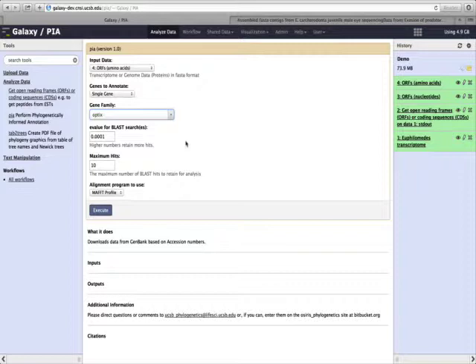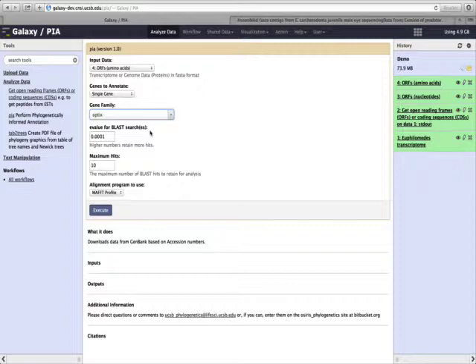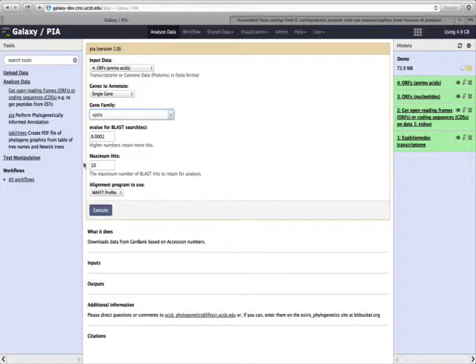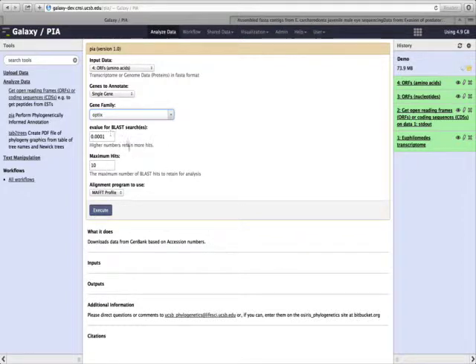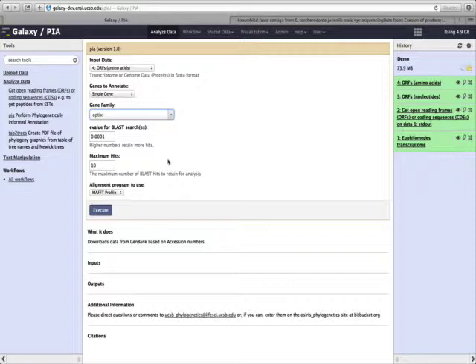We also have the ability to change the e-value for our BLAST searches. What PIA will do first is search for optix genes within our dataset, and this sets the specificity of those searches. We can also choose the maximum number of hits that we include. By having a higher e-value and a higher maximum number of hits, we will include more genes based on similarity alone that will be placed onto our phylogenetic tree of interest.